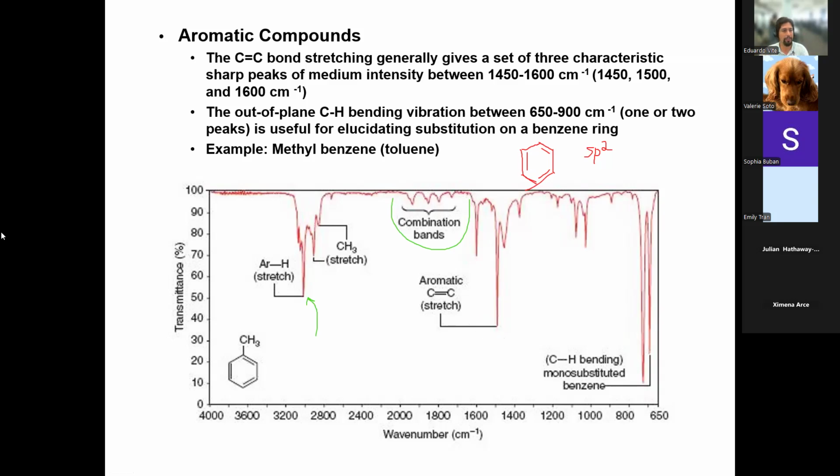So again, another one to be on the lookout for is this one here. You have this sharp medium peak at around 1500. And this is where you got to be careful because a lot of people confuse a carbon-carbon double bond peak with a carbon double bond oxygen peak. They are close to each other, but one is at 1700 and this one is at 1500. So make sure you're always reading your x-axis before you begin any judgments. Okay? But this is just an example of how aromatic rings can sharpen the complete spectra and they have their own iconic representative peaks as well, right?